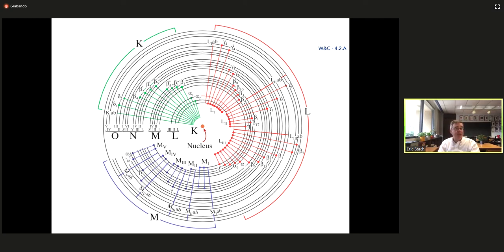And so in the spectroscopic notation, that's called a K alpha 1 X-ray detected in EDS. But also in the inelastic scattering mode, that's what's called an L3 edge in EELS, or it's also called an L3 edge in XANES. So there's just different notations associated with the type of event that you have.